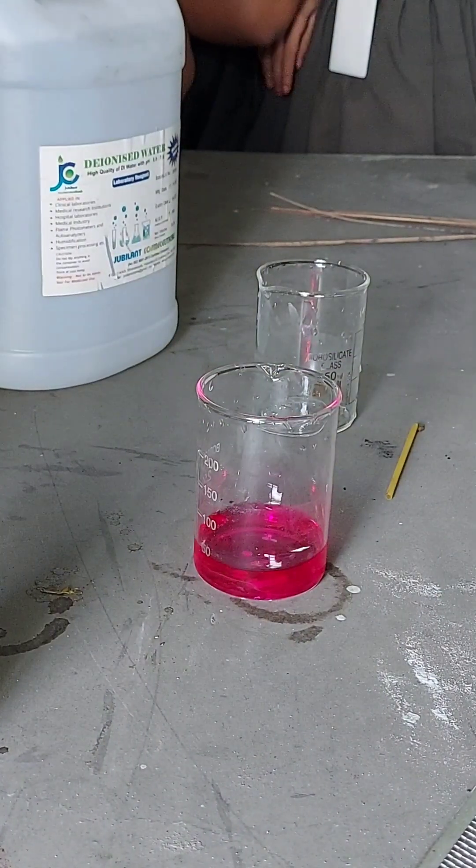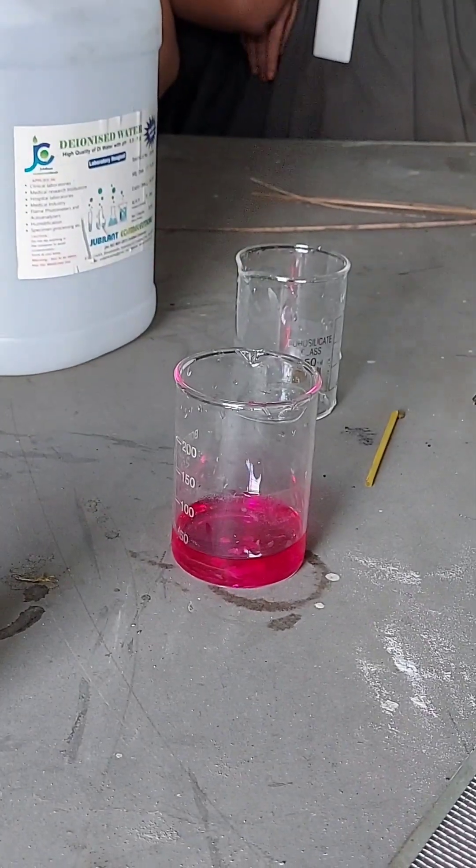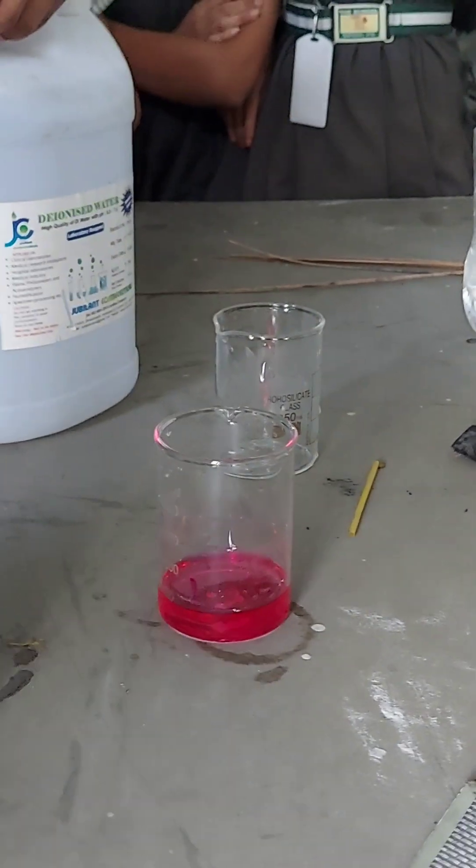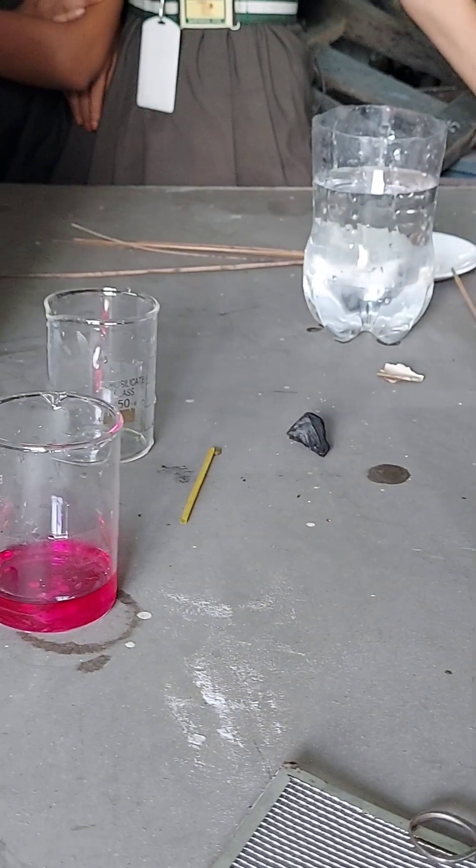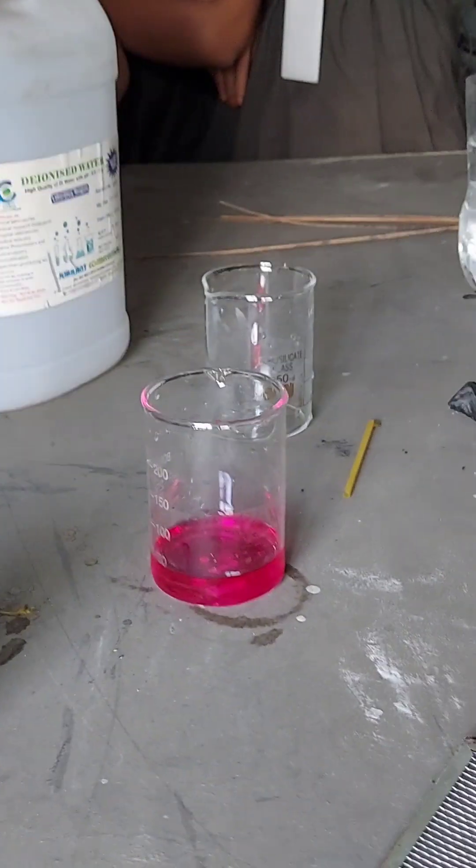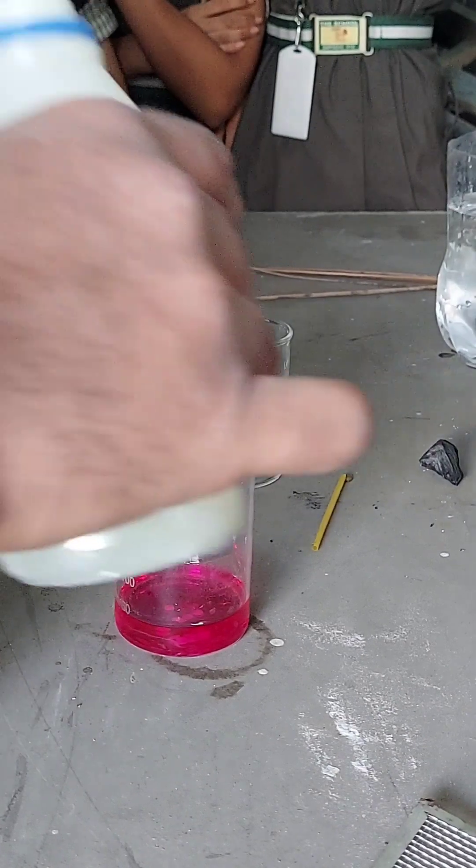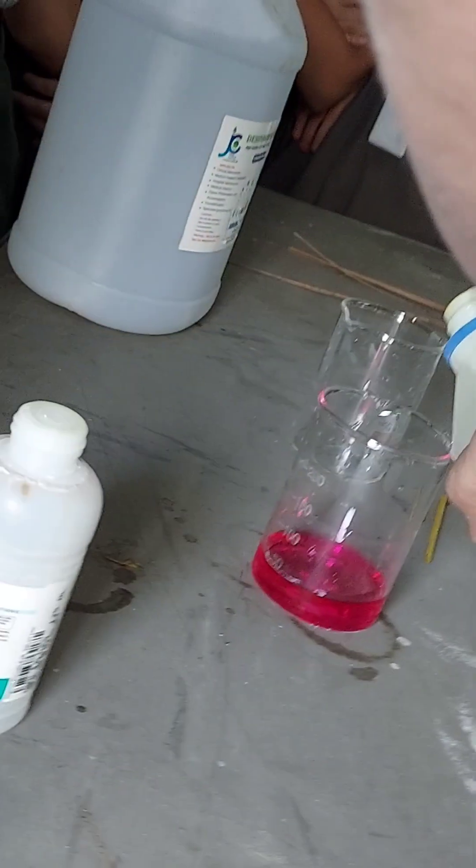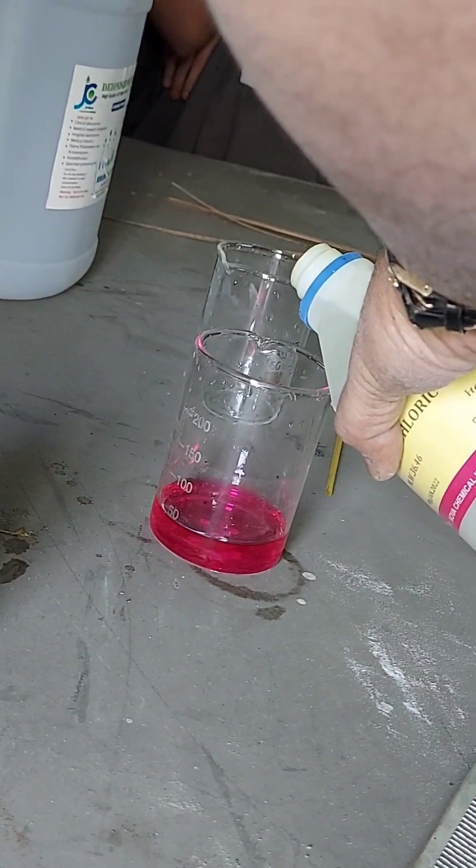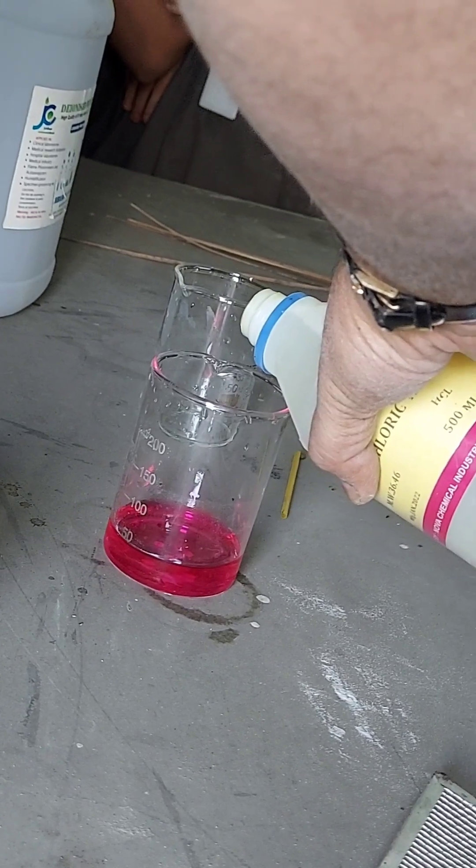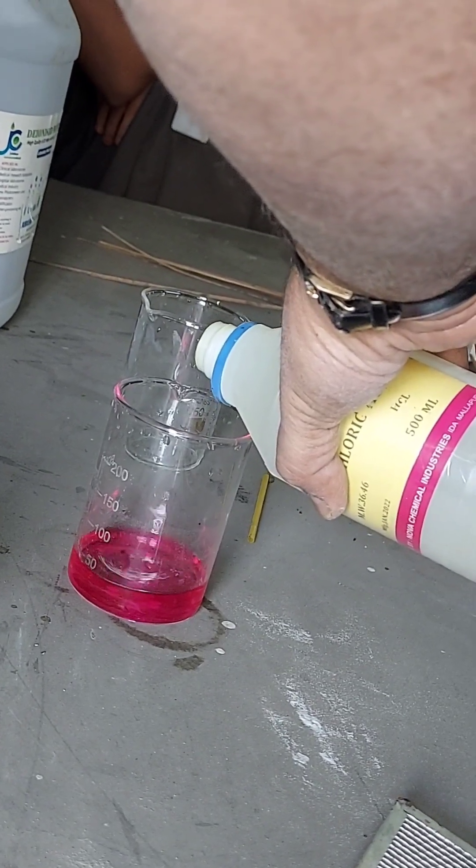Now if we add acid to this one, it will be colorless. So what will we do? We will take one acid. Sulfuric? No, no, no. Hydrochloric acid. Actually we should use a dropper, but we can directly add it. We will try to do it slowly.